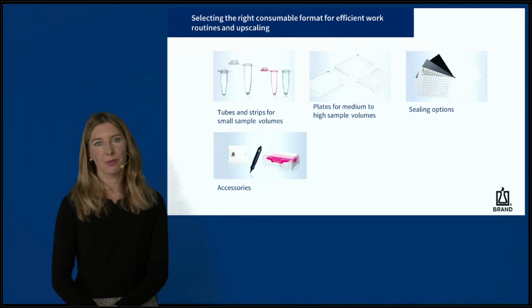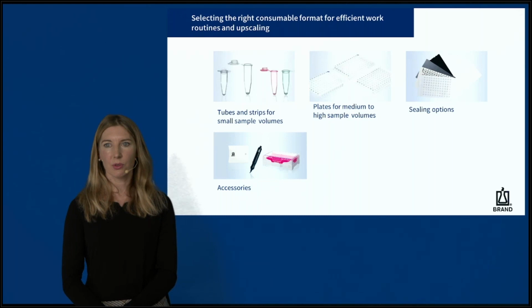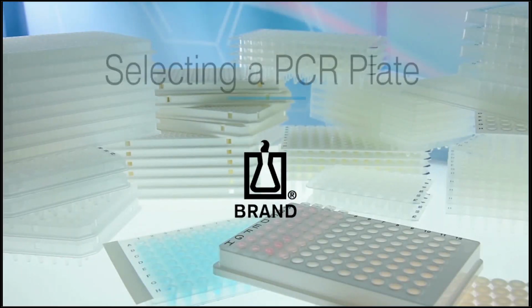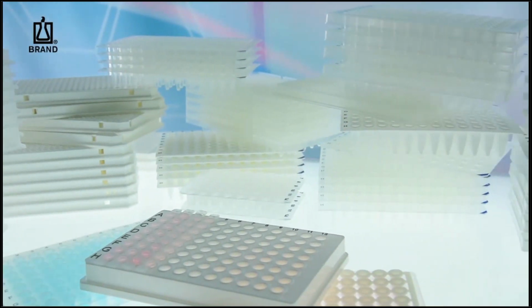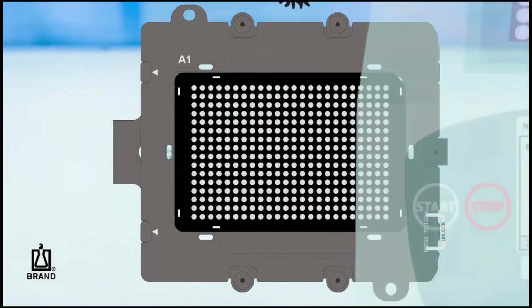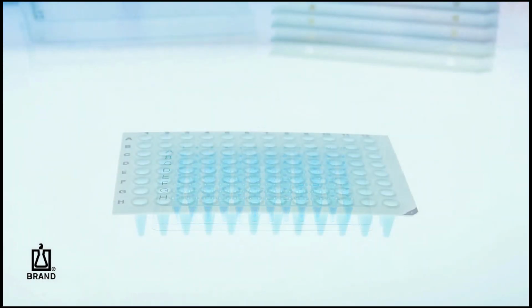If you are not sure which consumables and which setup suits your experiment, this video gives you a short overview of available formats. How to select a PCR plate. Selecting the correct PCR plate for your thermocycler can be daunting. To start your PCR plate selection process, you must know which thermocycler and block you'll be using. You must also ask the following key questions when doing traditional or real-time PCR.